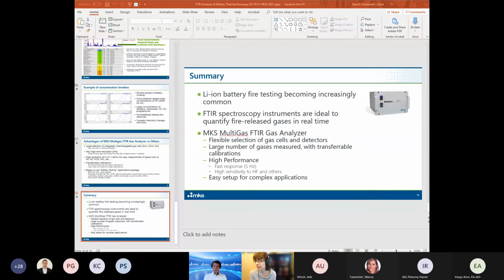I think there might also be a lot of difference from run to run. It's not like an emission of an engine where it's really repeatable, reproducible. There might be a lot of other parameters that really influence the way the fire or the decomposition is occurring, even run to run. So that's where people are doing research. Yeah, thank you very much.